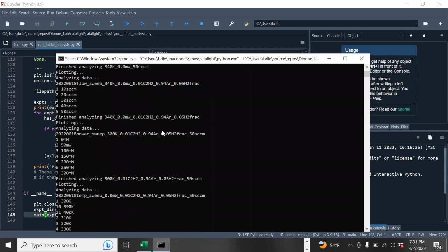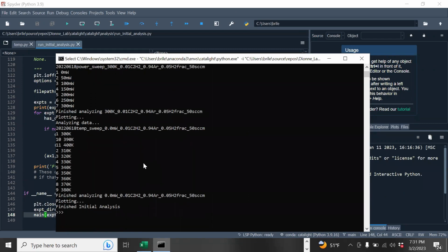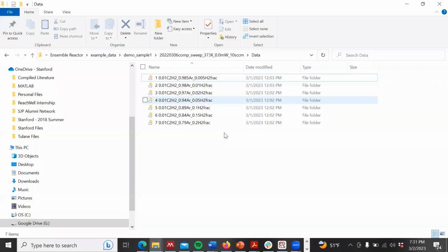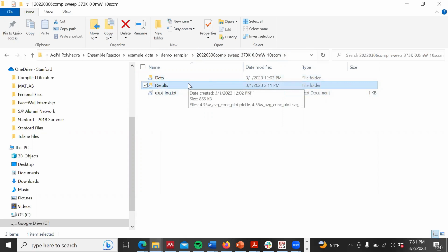So some things that are showing up outside of the elution times that you put in, the peak finder is detecting those things, and it's basically saying, hey, you might want to pay attention to what this is. It doesn't do anything more than that. So if you want to look at those, then you need to pull up those specific runs and see what those other peaks are, and try to figure out what's going on in your chemistry.